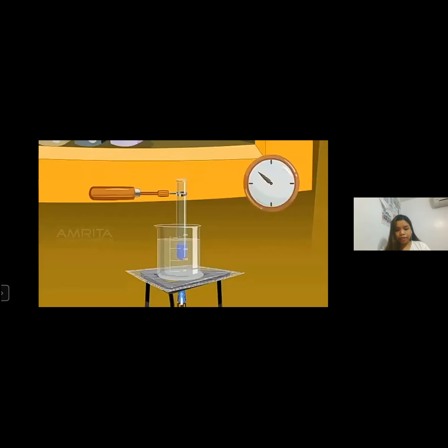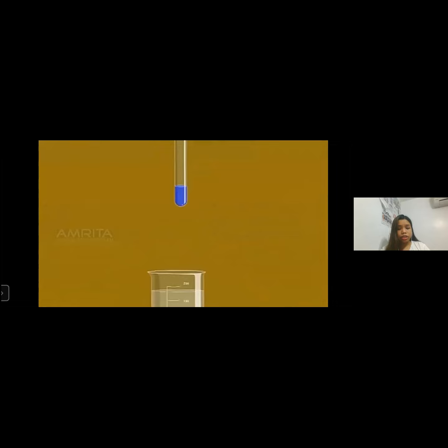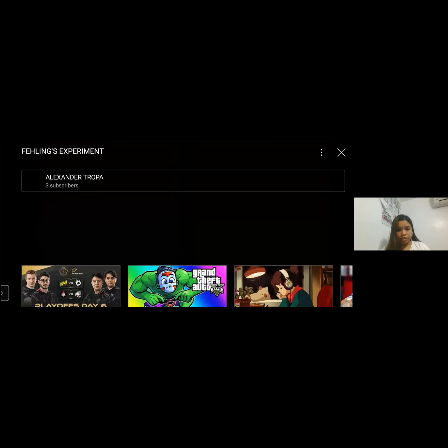As you may have observed, the color remains the same, just like in our sucrose solution. It means that our test came out negative, indicating that the starch does not contain reducing sugar, meaning any sugar that is capable of acting as a reducing agent.